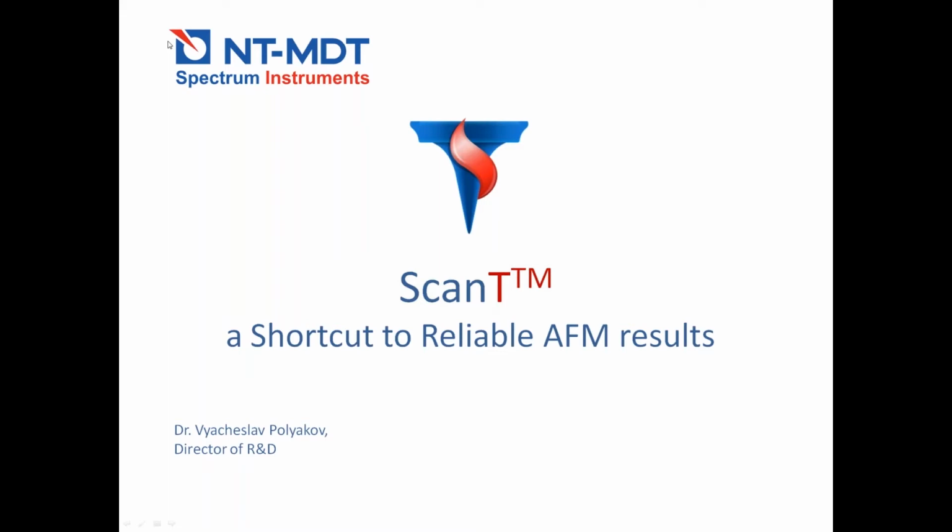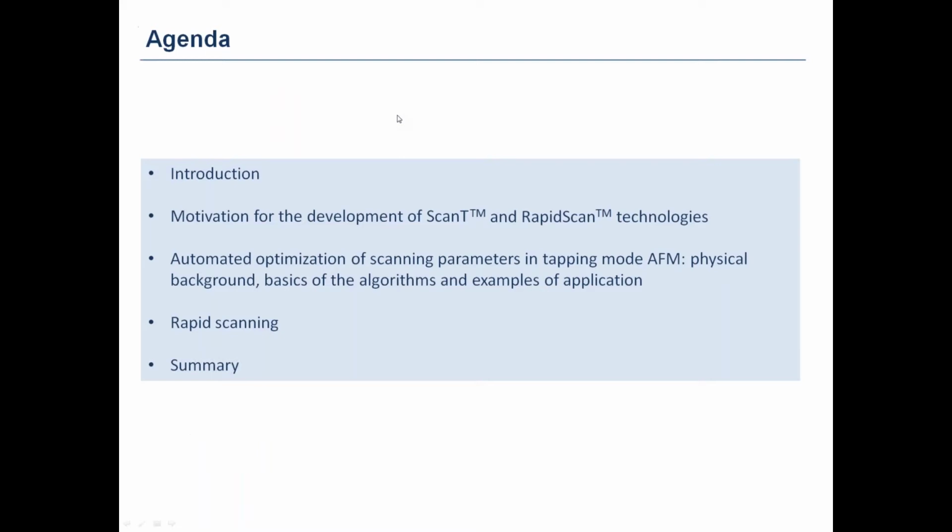Thank you, Stanislav, for the introduction, and I would like to warmly welcome all attendees of our webinar, ScanT, a shortcut to reliable AFM results. The agenda of our talk is the following. After a brief introduction, we'll describe our motivation for developing two new techniques that we call ScanT and rapid scan technology.